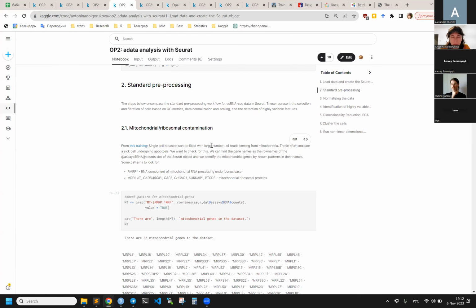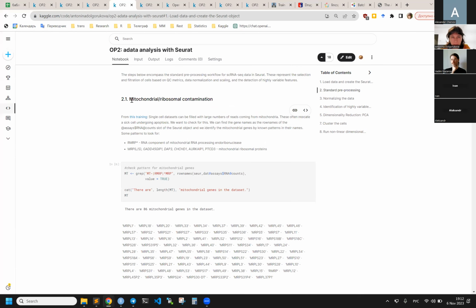It usually includes examination of mitochondrial and ribosomal contamination. The thing is, single cell data commonly consist of large numbers of reads from mitochondria, and this may indicate that these cells, with most of the reads from mitochondrial genes, are dying.